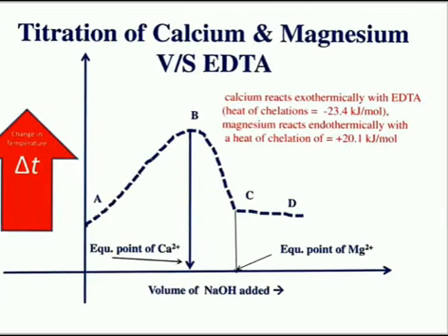Another application of thermometric titration is the titration of a mixture of calcium and magnesium with EDTA.